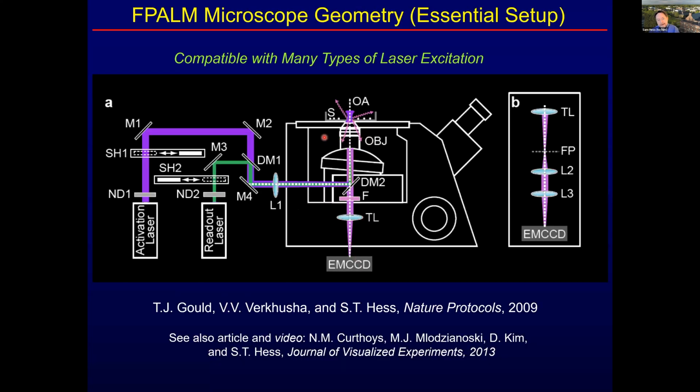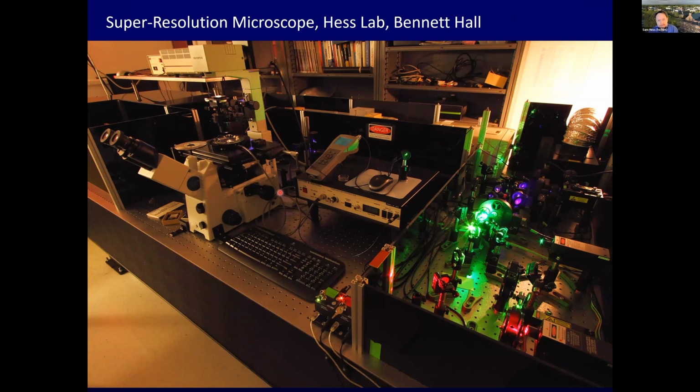And just to point out, this is not a complex system. It's a fluorescence microscope with a sensitive camera and 2 lasers. That's really the essence of it. So this is an accessible thing to many labs. And at the University of Maine, of course, we're not the wealthiest university in the world, and the ability to do this in our lab and develop it was really very helpful, and also not too expensive. This is one of our scopes.